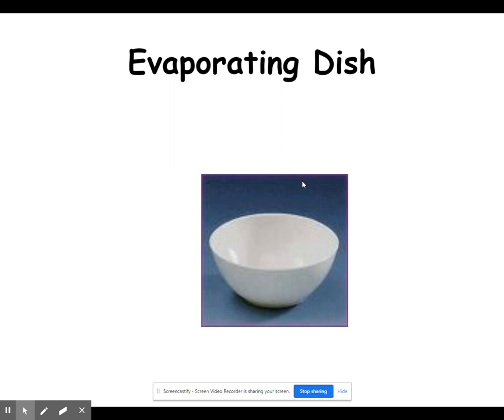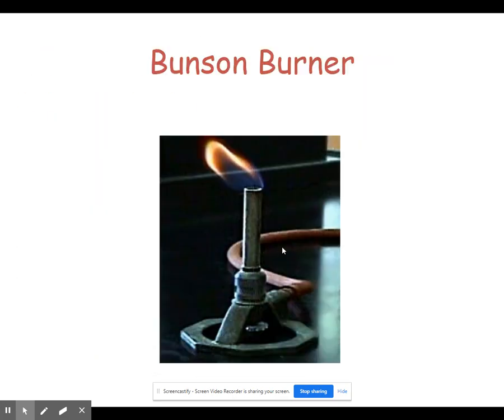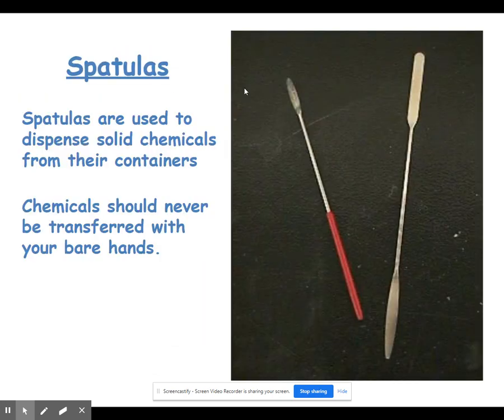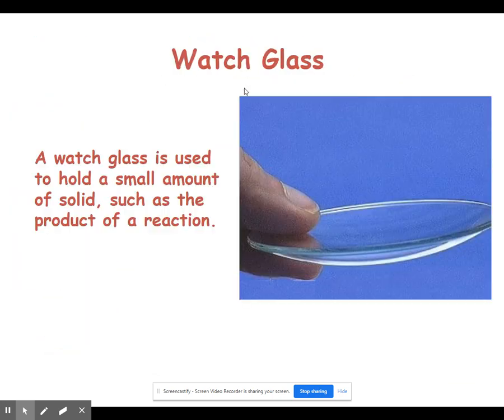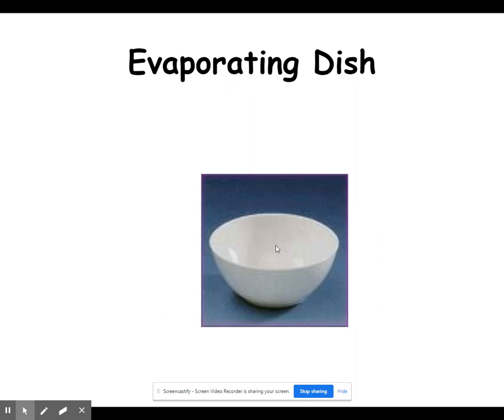The next piece of equipment is an evaporating dish — a small white ceramic piece used to, as you might guess, evaporate things. You place a solution in the evaporating dish, put it on top of a Bunsen burner, it heats up, the liquid evaporates, and you're left with a solid. Similar to the evaporating dish is the crucible, which is also typically ceramic and used to heat something. The main difference is that we typically heat solids inside a crucible and liquids in the evaporating dish.